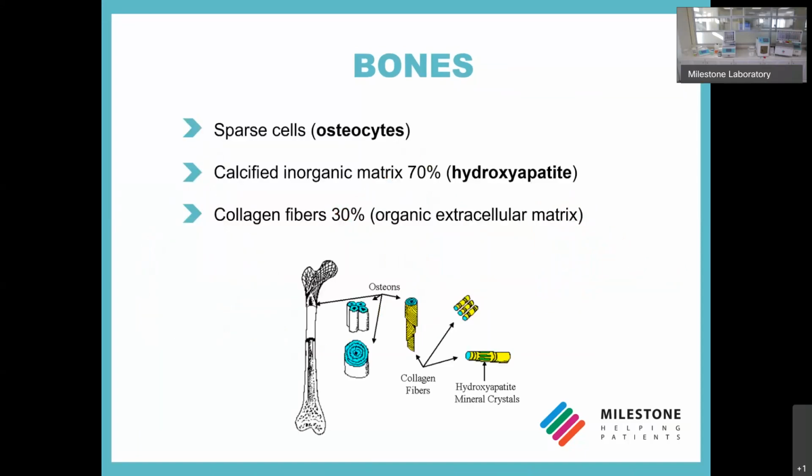Bone consists of three major components. There are cells named osteocytes, and they are surrounded by a calcified matrix. And then the collagen fibers type 1. And now I'm going to reveal to you which is our great enemy. It's hydroxyapatite. It's such an enemy that I have been trying to properly pronounce this word for 2 days, and really I cannot, as you can notice.